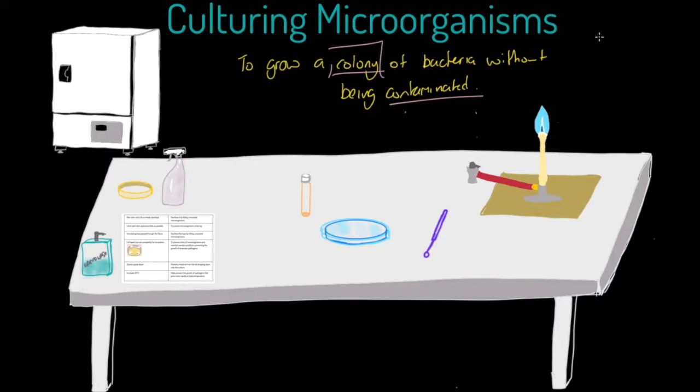I'm going to show you a method of preparing your agar plate called streaking to isolate, and I'll cover that in detail in a few moments. First, let me show you the general setup and some anti-contamination processes. Notice we've got hand wash and antibacterial spray — make sure your bench and hands are clean before we begin.